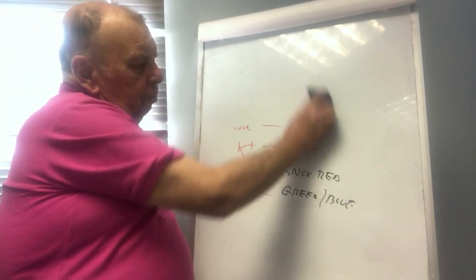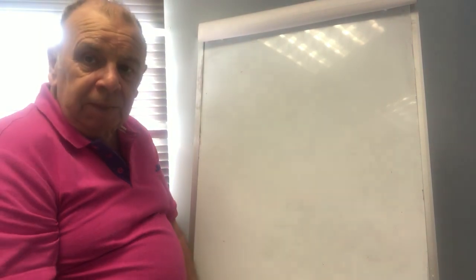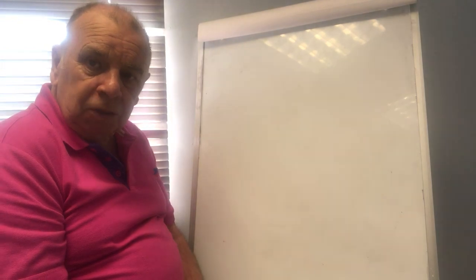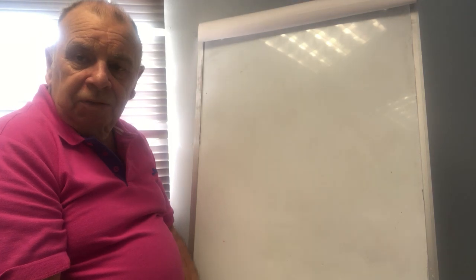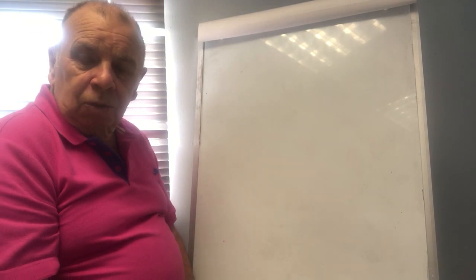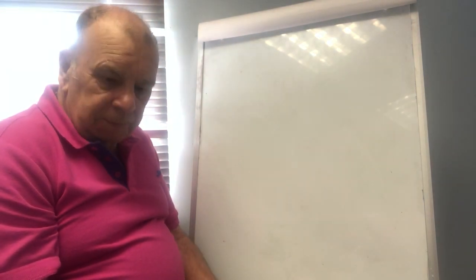I've just said there that you put compounds containing copper or whatever I've just been through into a flame. There's a device called a flame photometer. This is a piece of apparatus. You take your sample, heat it up, and you've got an analyzer inside it, a spectrometer which analyzes the colours produced from burning those compounds.